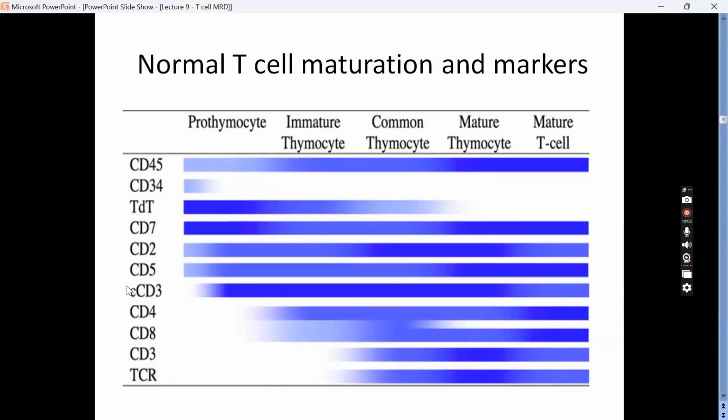You find the myeloid cells differentiate towards erythroid, megakaryocytes, basophils, many lineages, right? PDCs, and so on. So you need to know each of the different maturation patterns, in contrast to B-ALL, where it's a simple maturation pattern, and in T-ALL no maturation patterns are needed to detect the MRD. So this is a repetition of the last lecture.